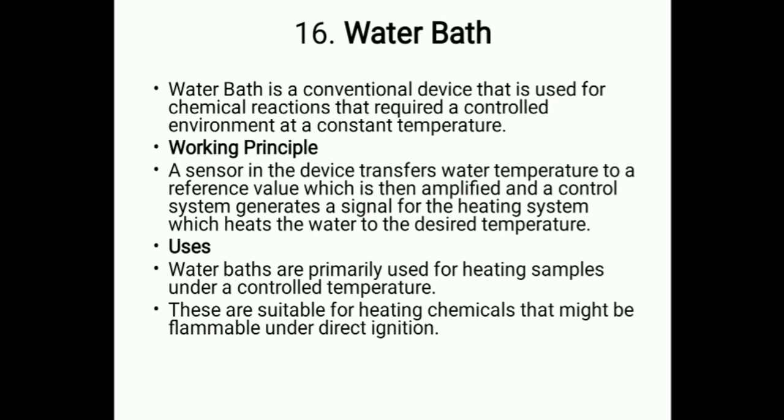So next we have water bath. Water bath is a conventional device that is used for chemical reactions that require a controlled environment at a constant temperature. Talking about the working principle, a sensor in the device transfers water temperature to the reference value, which is then amplified and the control system generates a signal for the heating system, which heats the water to the desired temperature.